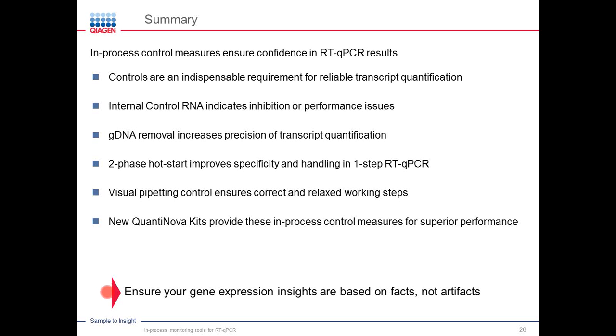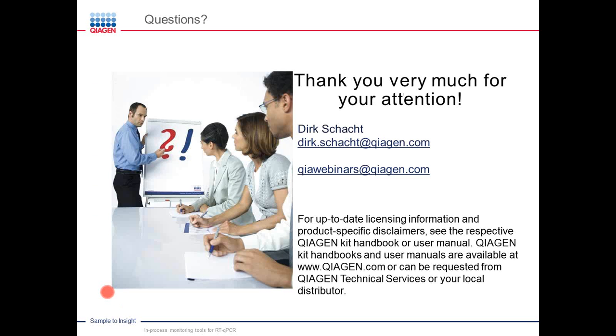So the key point here is that they help to ensure that the insights, the results we're getting from gene expression research, are really based on the expression profile and not on any types of variables or artifacts that can potentially be included.